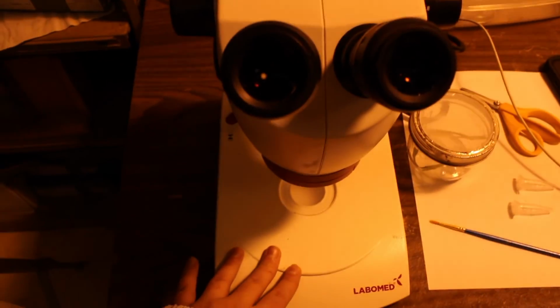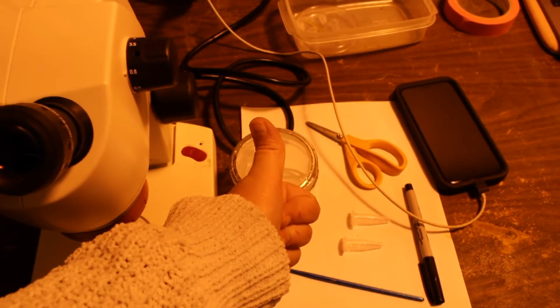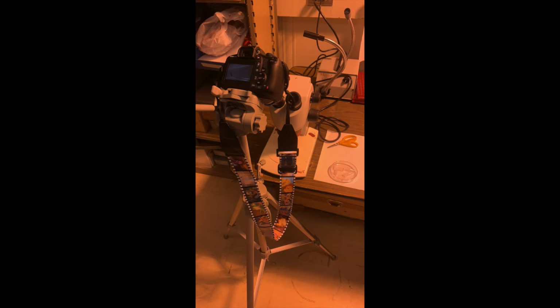You need a microscope, preferably one that works, and you should be good to go. Actually, wait, you need something to record time. And it was really hard to get the camera just right. I just want to point that out.